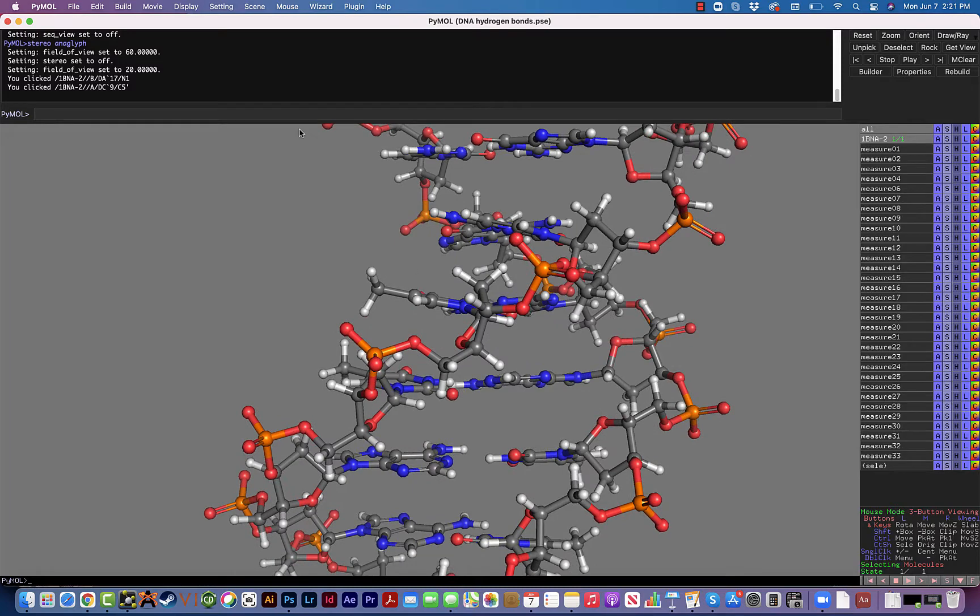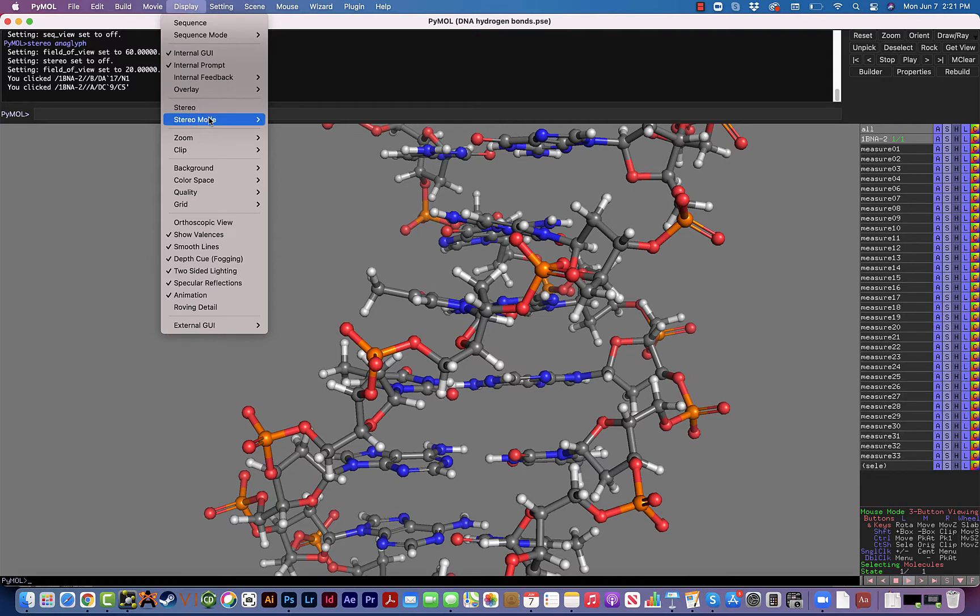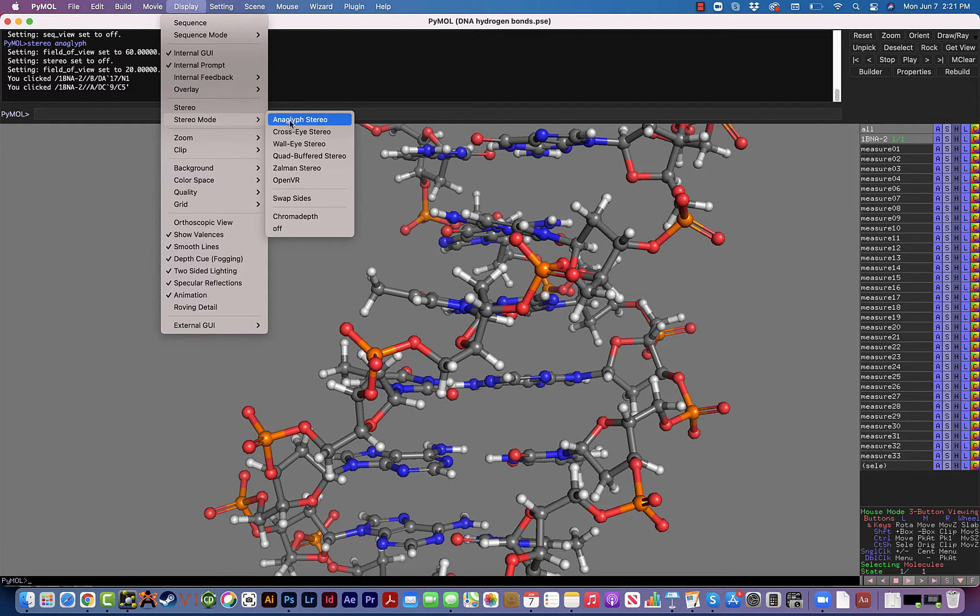To turn on the stereo view, what we're going to do is go up to where it says Display and scroll down to where it says Stereo Mode, and we're going to be using the Anaglyph Stereo, which is the kind of image that will work with our red and blue glasses.